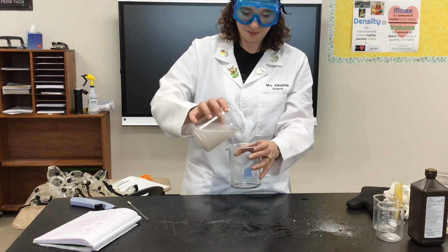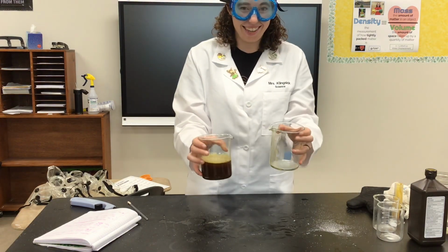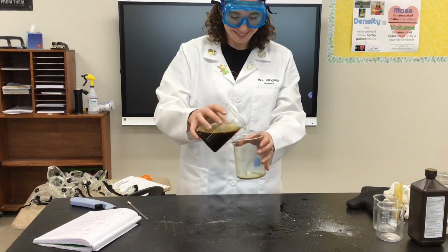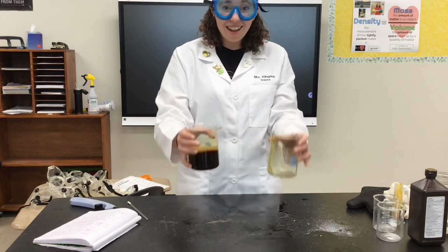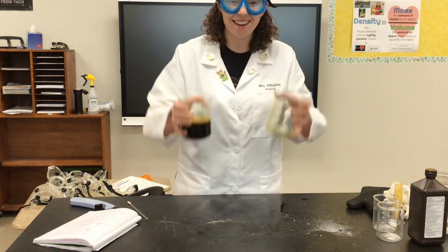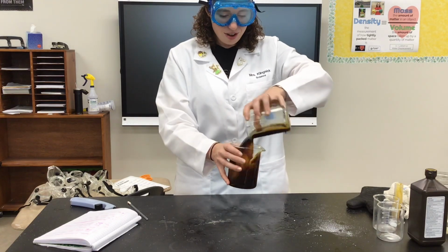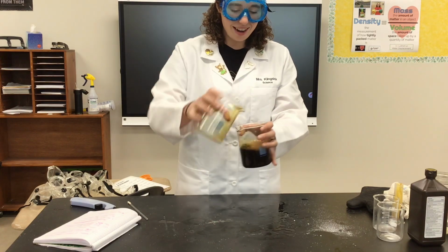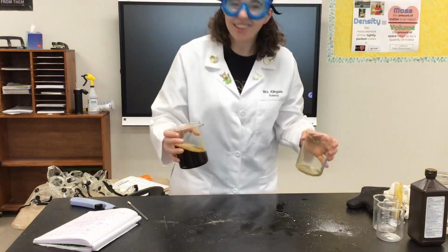Watching. Did you see it? Every time it's so cool. So we just had a major color change, and that lets me know that a chemical change just happened. Isn't that the coolest thing ever? So this brown liquid is a new substance. I started with my 2 substances in the small container, and it has chemically changed into something else. Coolest thing ever.